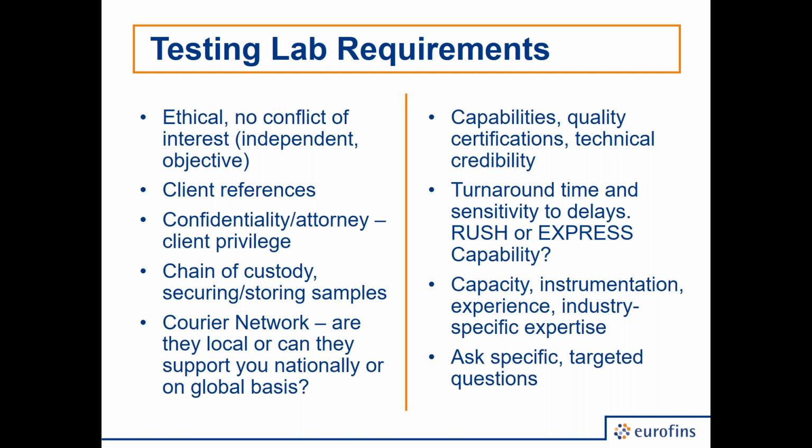If you're doing anything involving insurance or legal work, it's very important to have attorney-client privilege and all the right types of administrative controls, from the time a sample comes to the lab to when a report or certificate of analysis goes out the door. What kind of chain of custody do they have? Is it written? Is it electronic? Is it documented? Are samples stored in a locked, secure area?